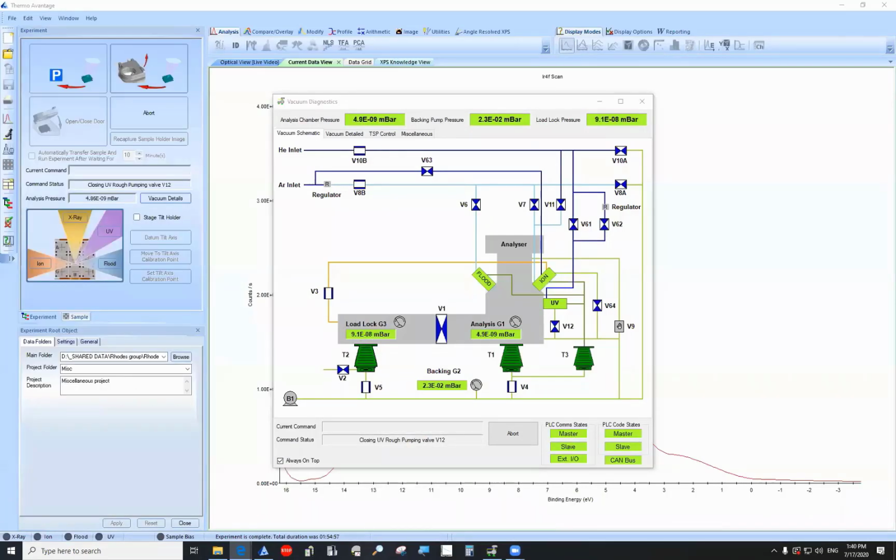So now I'm moving on to slide number 14 on the SOP, which is mount sample. It needs to be configured for the relative height range of your specimens. We left it at the 0 to 5 millimeter thickness because you guys are typically doing thin film stuff. You're going to attach that to a top plate using these clips. There's different top plates for different sample sizes.